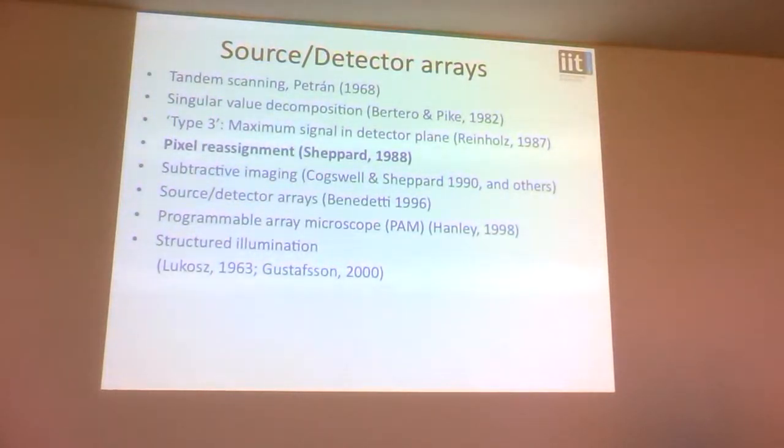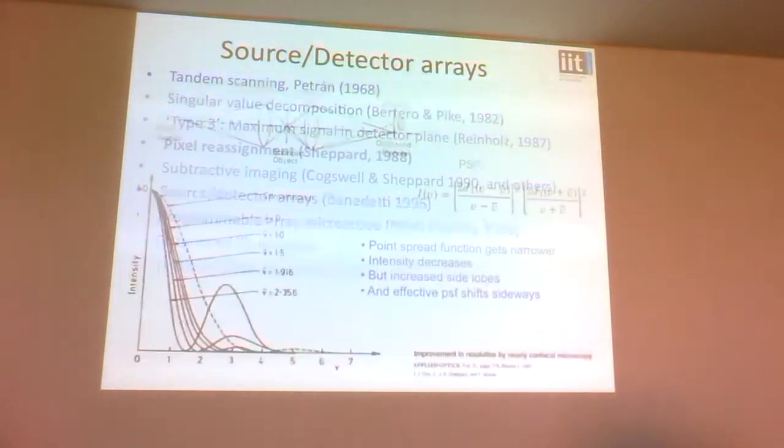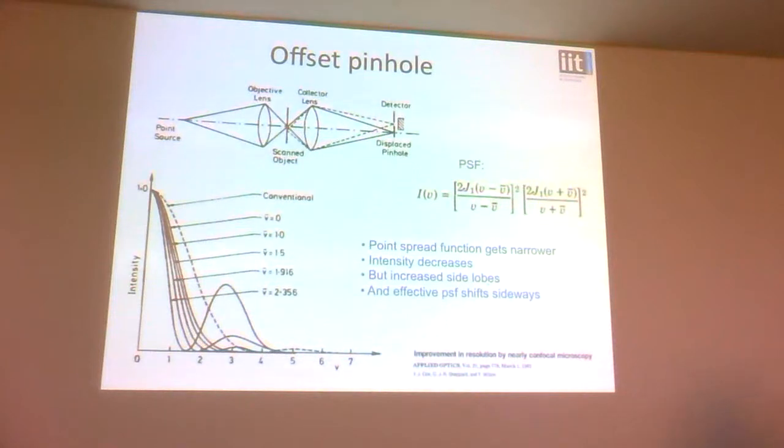But also you have to take into account that 1988 was very early days for confocal. This was a period when the confocal microscope really took off in the bio area around 1987-88. So the standard confocal was really only taking off then. I'll say a bit about that. It all really dates back to my student Ingemar Kotz, I mentioned several times.